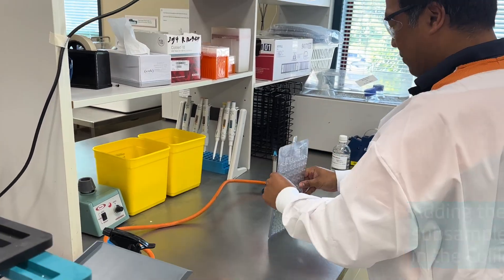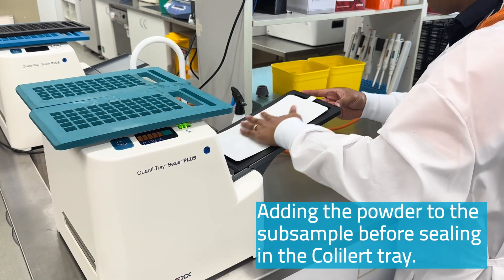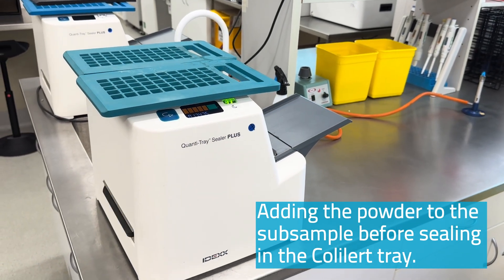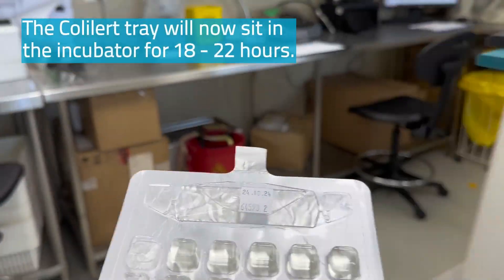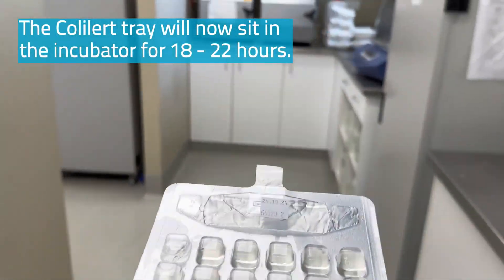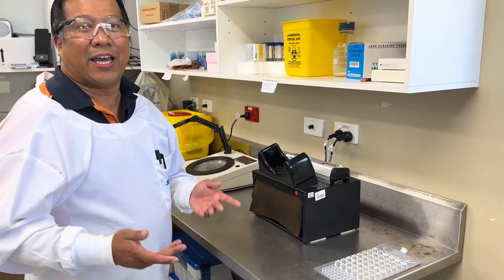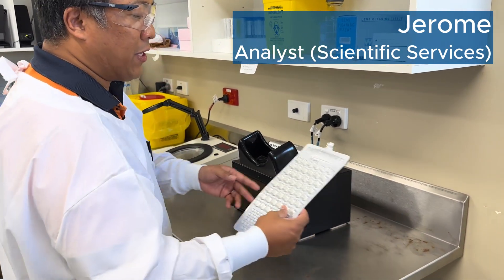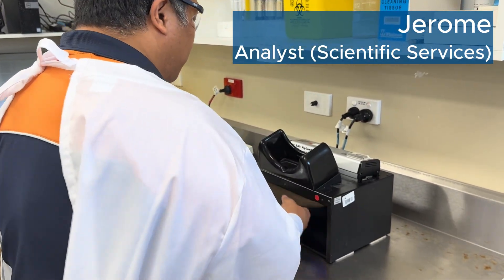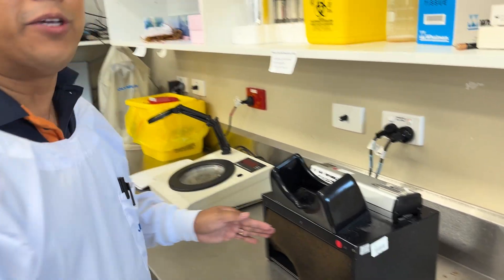Last stop, I'm here with Jerome from the microbiology team. What are we going to test for today, Jerome? Hello everybody, my name's Jerome and we'll be testing it below using the Colilert. So after 18 to 22 hours, we'll be back to check the Colilert trays. And as we can see from here, we're going to stay yellow and we're going to check for coliforms.